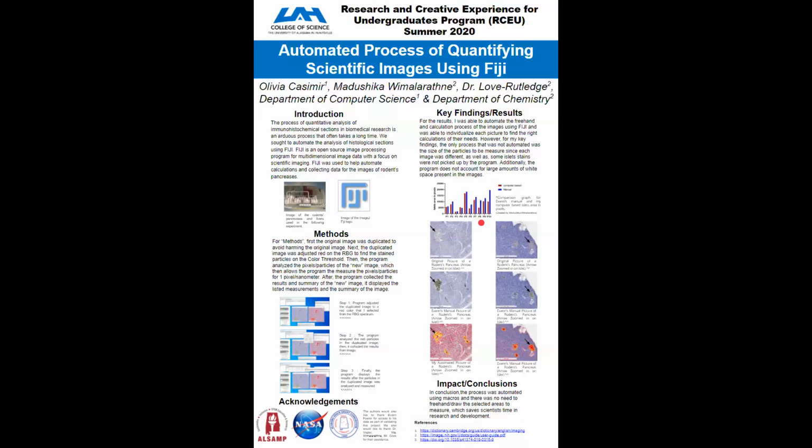However, in this section at P8 and P10, which is known as picture 8 and picture 10, the difference was quite absurd. However, the reason for such was that my program was able to pick up the same colors for the islet and not the white space. However, if I can show you an example here, this was picture 10 for rat 17, my bad.